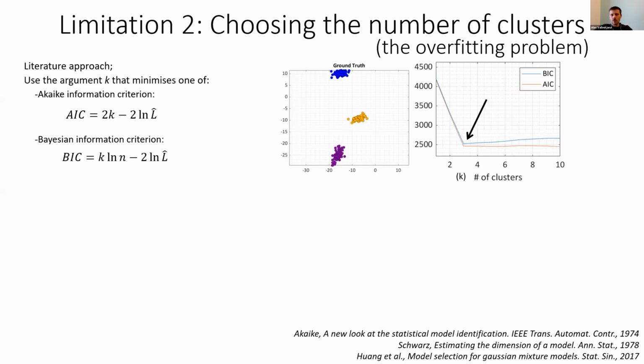So you say we have 400 clusters, and each cluster has only 1 element. This is why this is called the overfitting problem. The computer cannot tell if that is a better solution or a worse solution. You need to somehow tell it, no, we are interested in lowering the number of clusters.